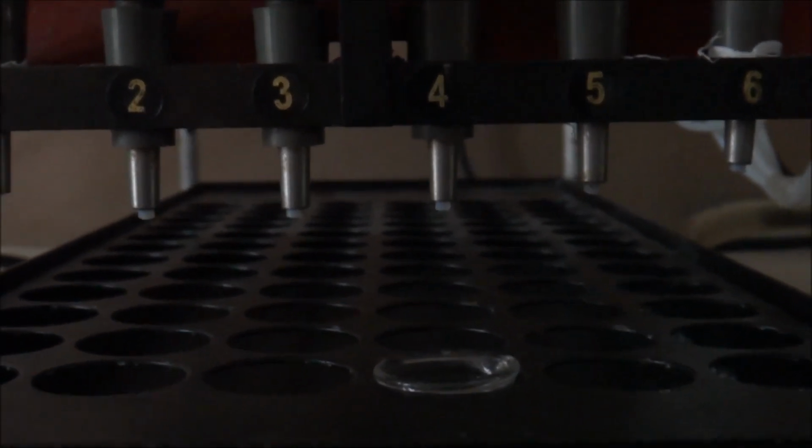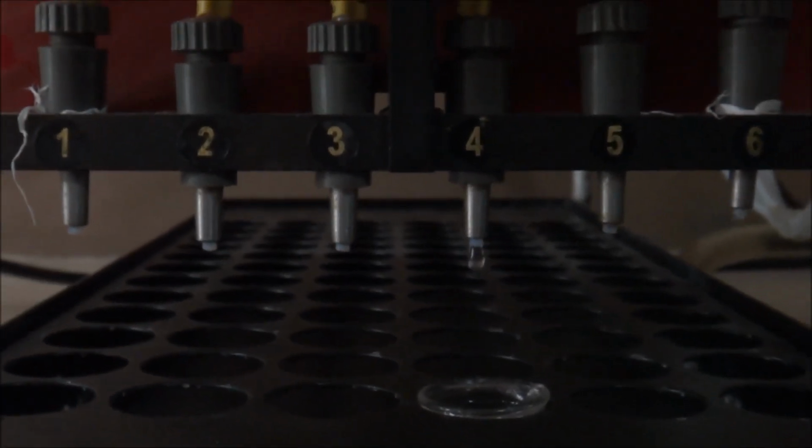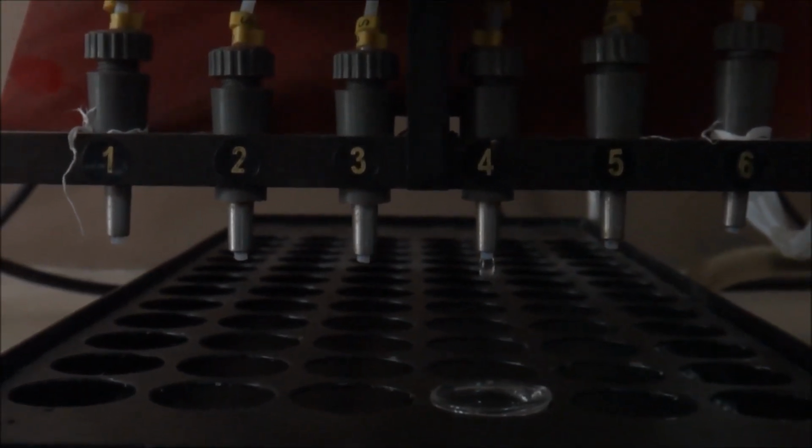So the sampler will go back and it will back suck for cleansing. That is, it's cleaning the pipes with the buffer.